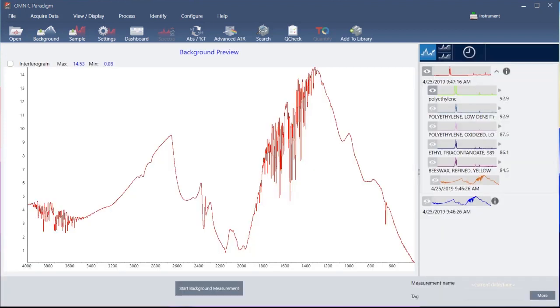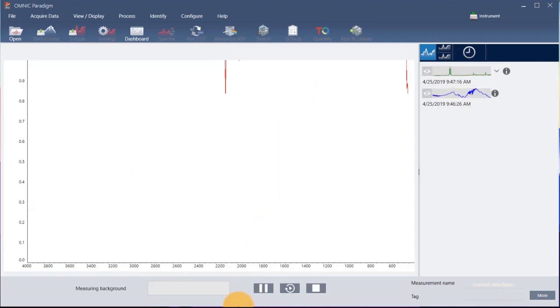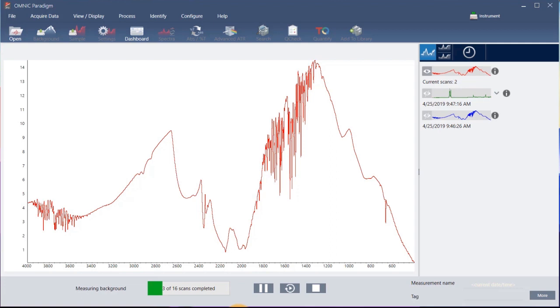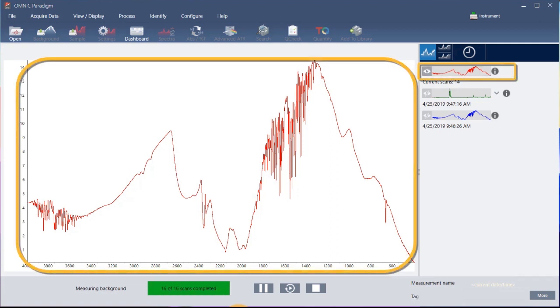Click here to start the background measurement. The software shows a preview of the current background spectrum in the spectral pane. This background shape is unique to the diamond crystal. Click here to start the background measurement. When the background measurement is completed, its image appears in the results panel and in the spectral pane.